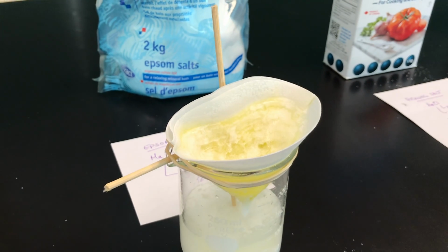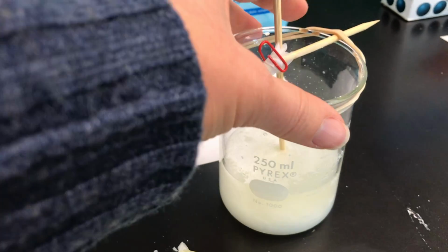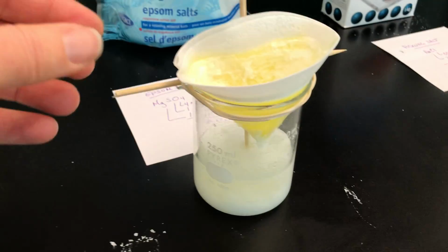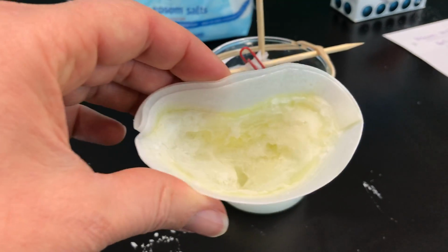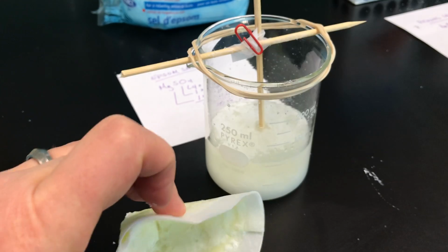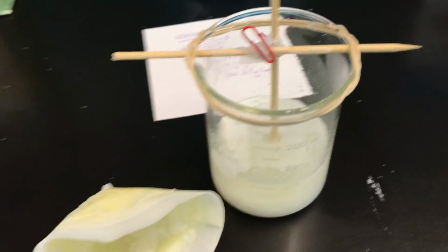The Epsom salts, I put a little bit of yellow in this one. The blue was dyed in the borax. In the Epsom salts, I actually had to reboil this one. So what happened was the initial solution didn't solidify at all. And so I put it back on the hot plate and added more Epsom salts and boiled it again. And I got a lot of crystals inside the filter paper. And my jar is almost completely solid. So real success on that, not really on the stick or the nucleation point.